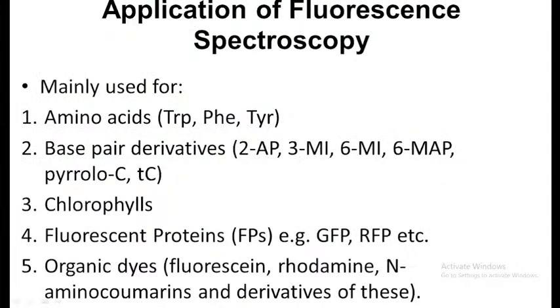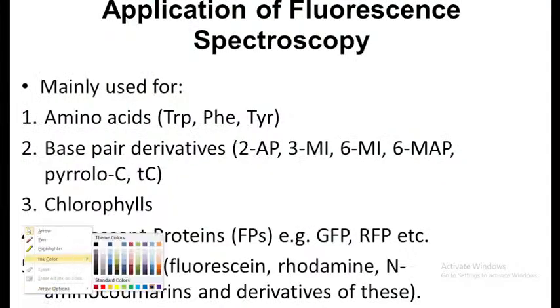Okay, next, talking about the applications of the fluorescence spectroscopy.